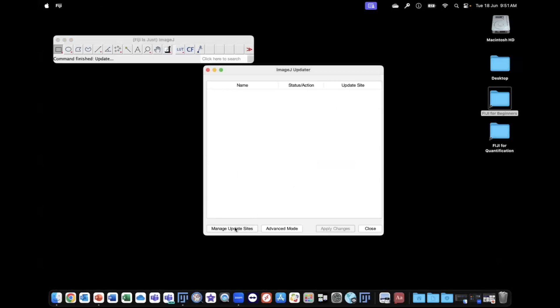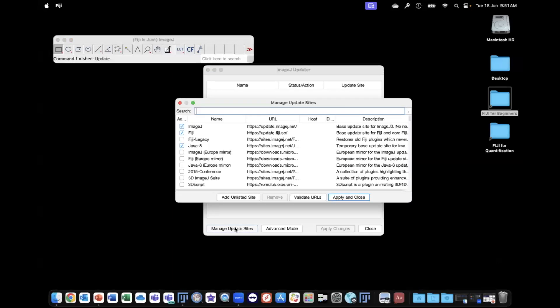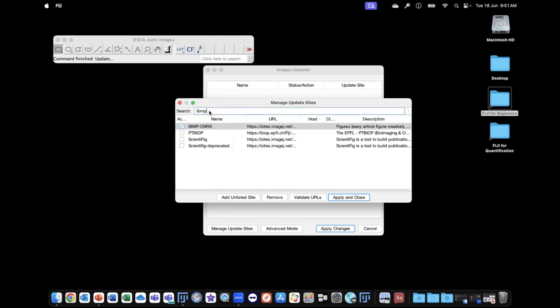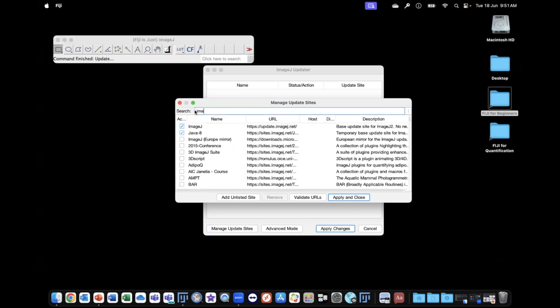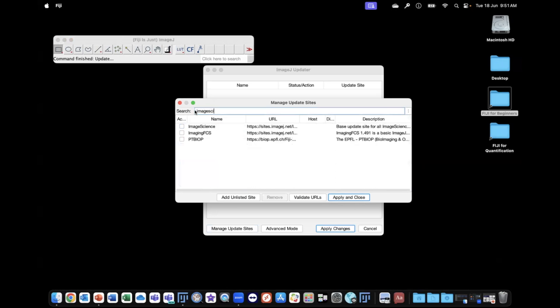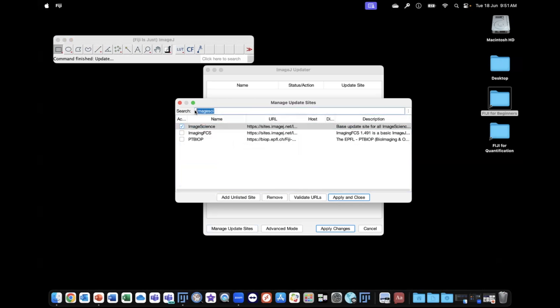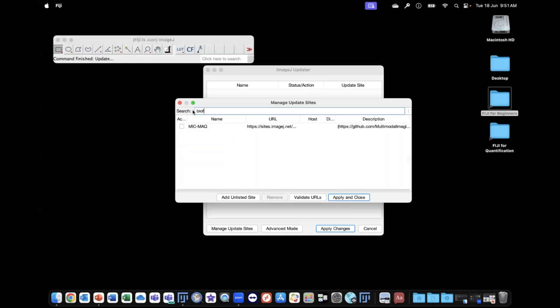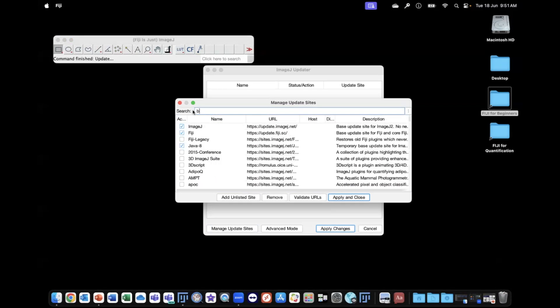You can then go to Manage Update Sites, and we can search for the sites we want to add. IBMP, so we need to add this one. We also need to add Image Science. BioFormats should already be installed.